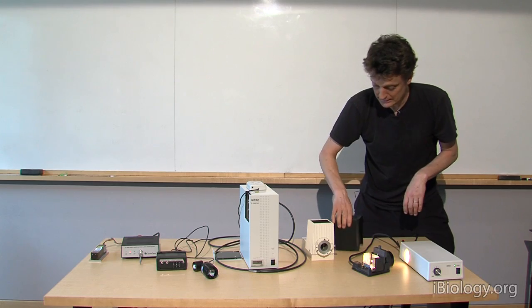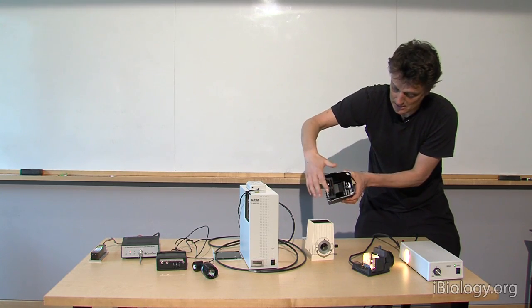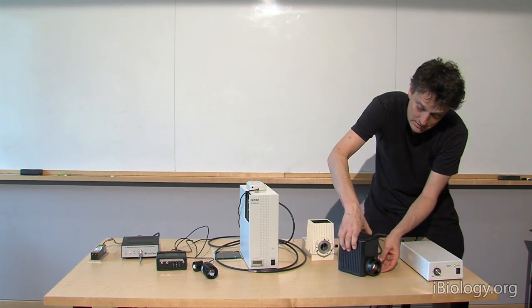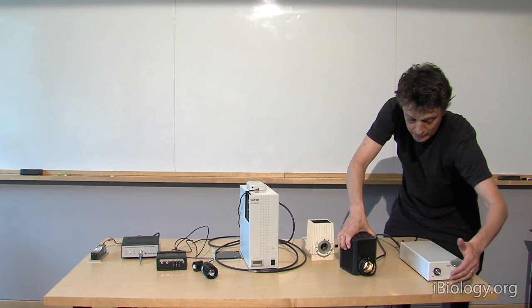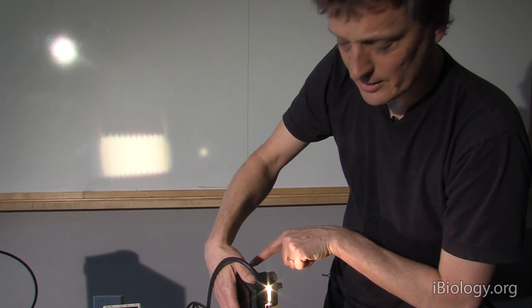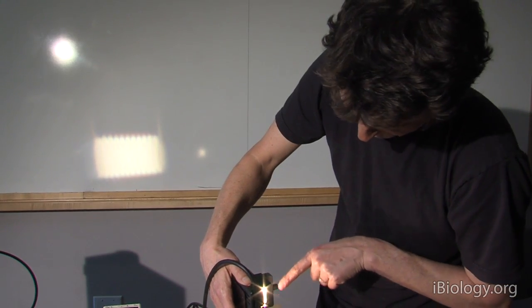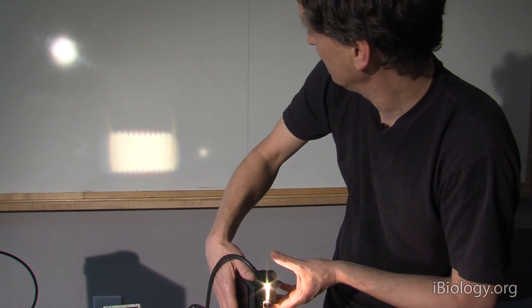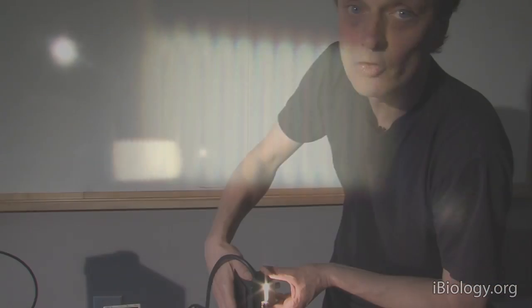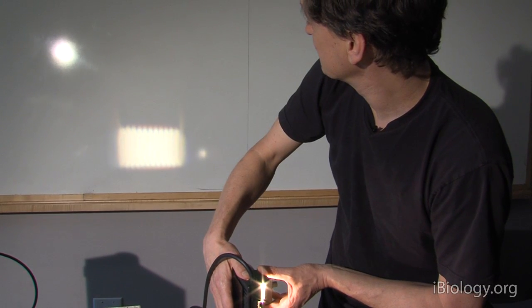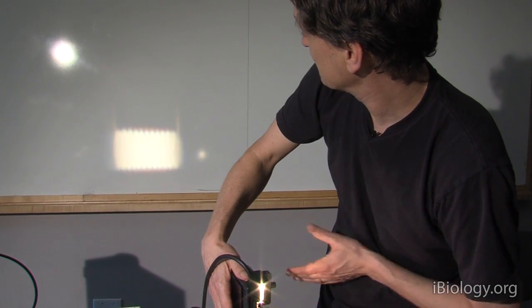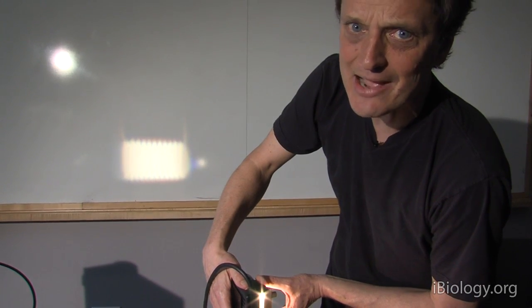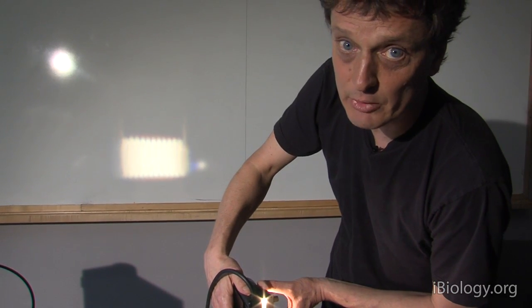Often that's not needed so this lamp house here is just completely black inside and all you get out is the light coming out of the front. Since we have a condenser lens here in front of that filament, that lens will make a magnified image of the filament and I project it here on the white board. That image of the filament, the image of our light source, is something that you will also encounter in various positions throughout the microscope.